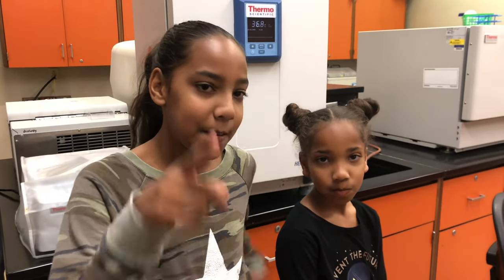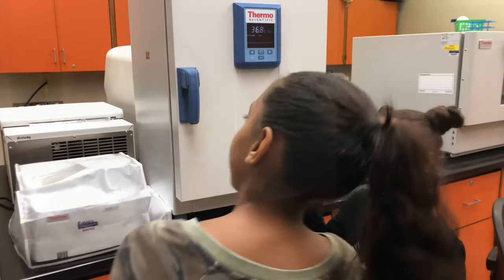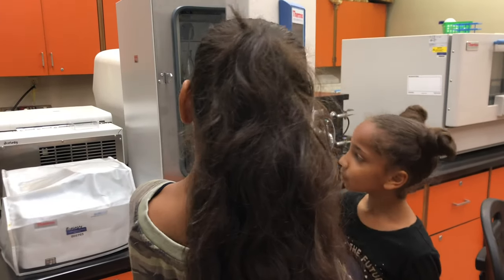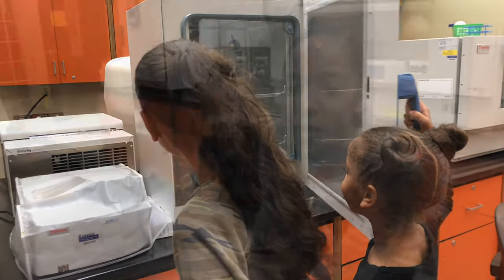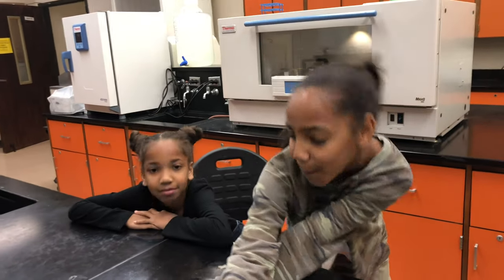Okay, remember we saw the article that hand blowers blow out fecal bacteria — well, we're about to check the results. It's been 48 hours of incubation. The incubator is behind us and we're gonna look at it now.